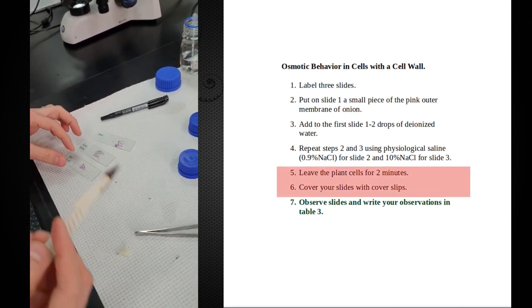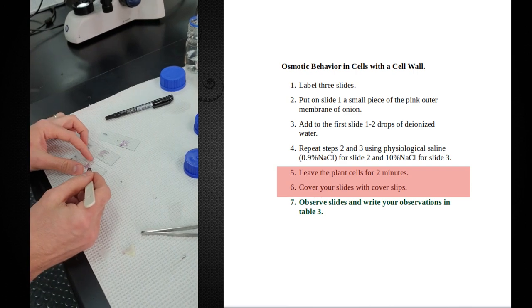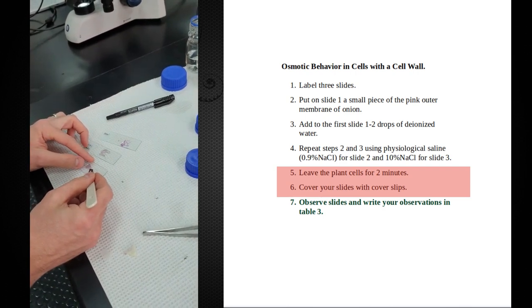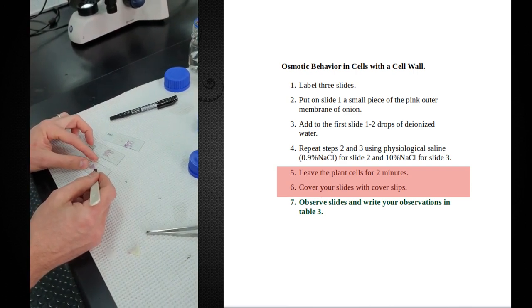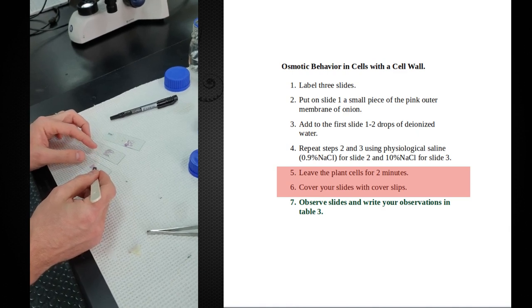So let's just get a couple of cover slips on there. I'm going to try to, oh, that's probably too fast. Hopefully we didn't drop too many air bubbles in there.